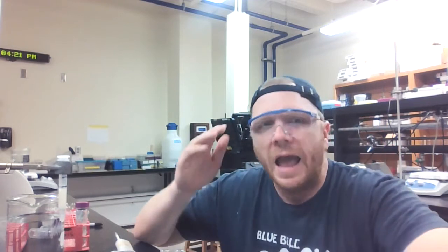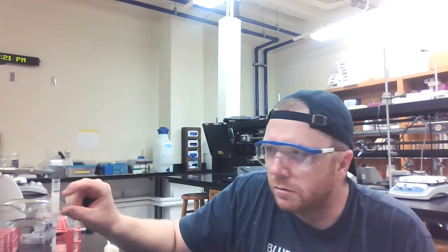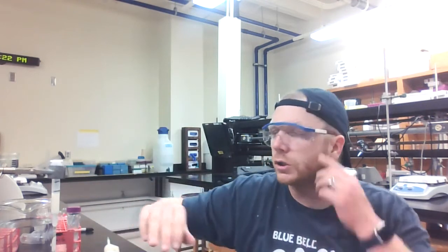Do not discard your column, but instead at that point, do your A280 measurements and your A595 measurements. After that point, you can then transition to doing your A340 LDH assays. I recommend doing that so you can get a good idea that, yes, everything that does not adhere to the column has flowed through. Those first 15 fractions where you're washing the column, the resin here is probably 3.5 milliliters. So if you wash this column with 15 milliliters, that's nearly 4 times the volume of that bed. So that's a good volume to wash this column, and lots of the stuff that does not adhere to the column is going to flow through.